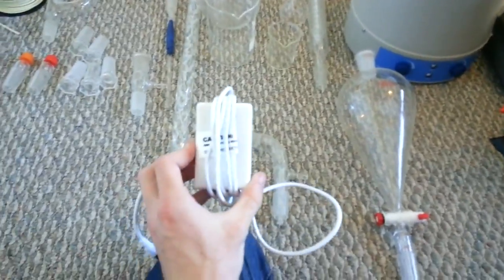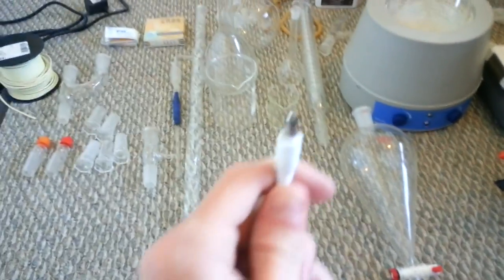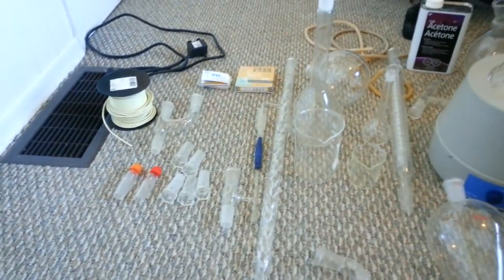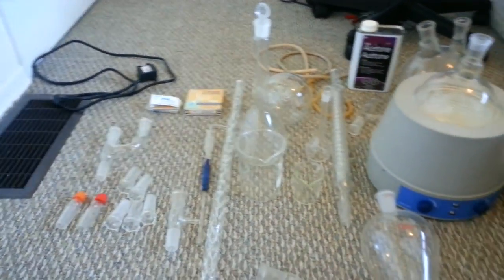If you're going to be doing any kind of electrolysis, you should have a power source. For this, I just use one of these normal wall warts, but you can use a laptop battery charger or anything that outputs a DC voltage. Having a connector like this on the outside is totally fine — you can use wire to connect the positive and negative. I'll show you how to do that in another video. If you are doing electrolysis, you do need wire. This was like $20 at Home Depot — it's copper wire. It doesn't really matter what you use though, since it's probably going to react with what you're doing anyway, so you just tape it up really tight to keep it sealed.